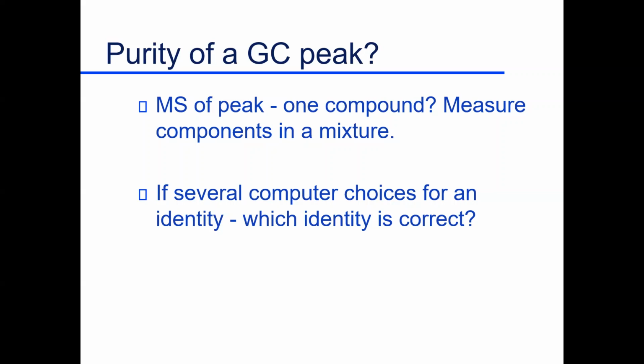A good deal of activity going on right now is looking at all the plant proteins, looking at the off-flavor components in the protein isolates, looking at the profile of the plant material it starts from, going through processing, and then looking at how your chemical profile of aroma compounds, volatile compounds, has changed. So you're going to be doing studies where you try to isolate all the volatiles and then look at the quantitative data on those volatiles, how they change with processing. But do you only get one choice when you do an identity? So you get a nice spectrum.